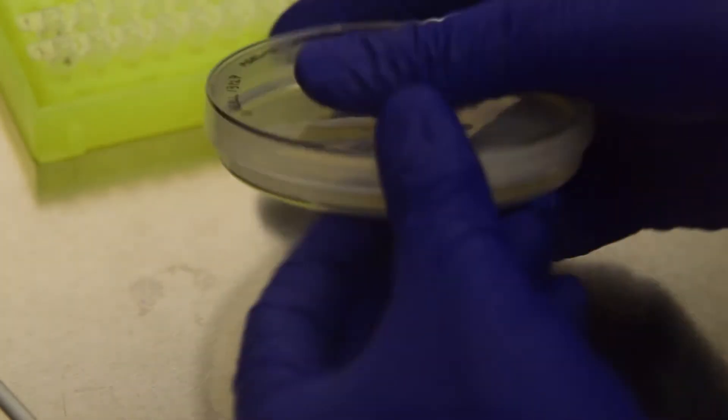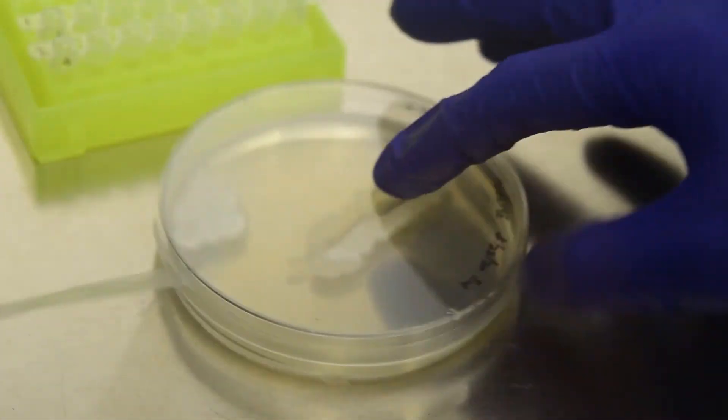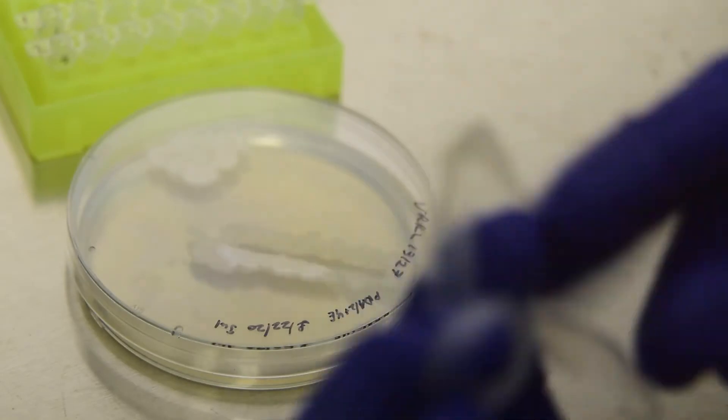Open the sample plates in the hood and remove the lid. Place the lid open side up in the hood. Using a needle, wire, or forceps, remove a small piece of tissue.